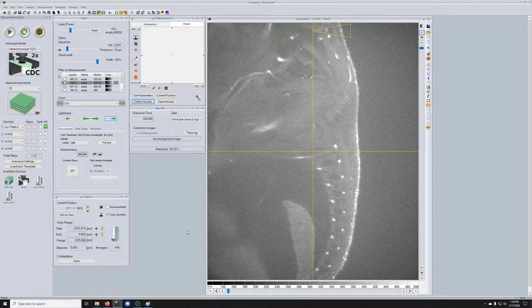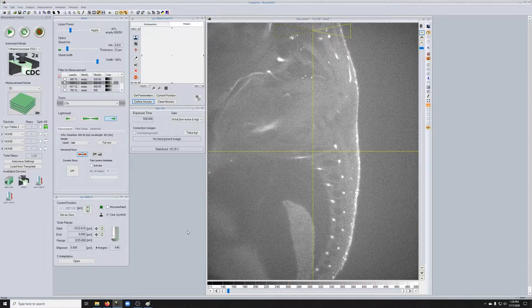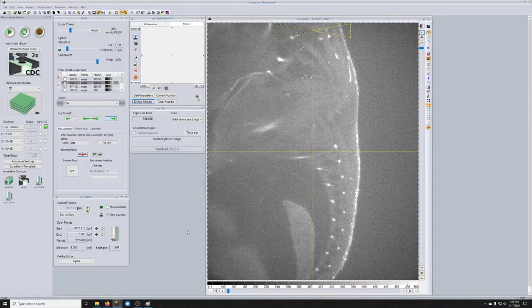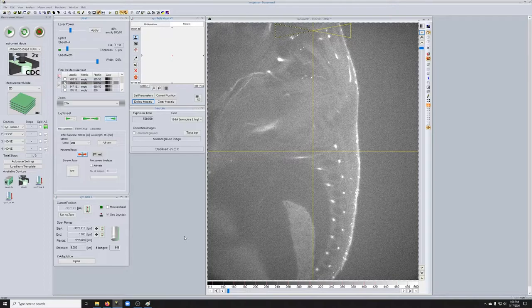And so here's an example. I've zoomed into that same embryo that I was showing you before, and I am now at a zoom of 2.5, and I've modified a few other settings to get a really nice resolution image. So let's say we wanted to tile. What's the first thing that we need to do when we want to do that?